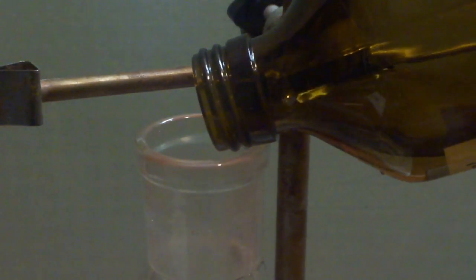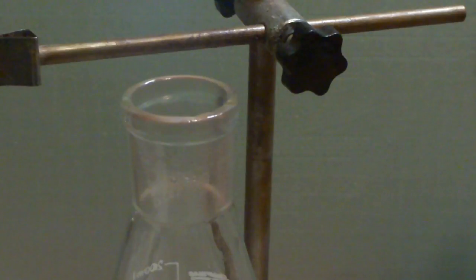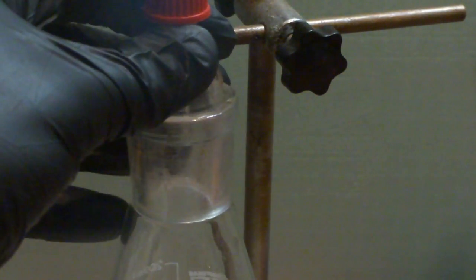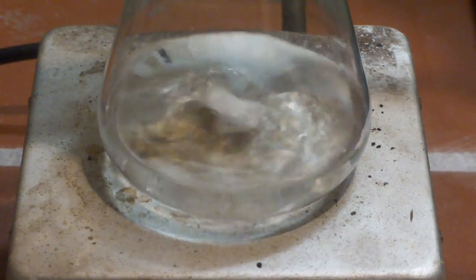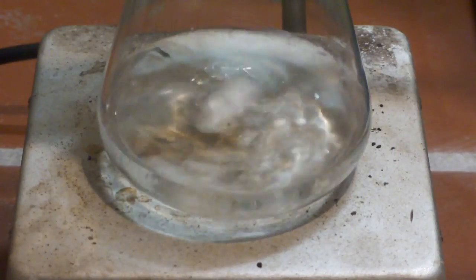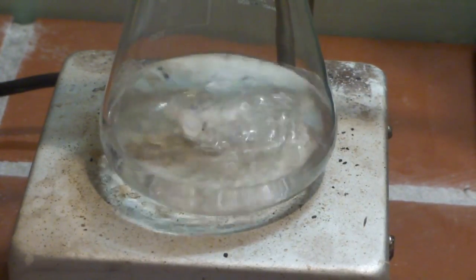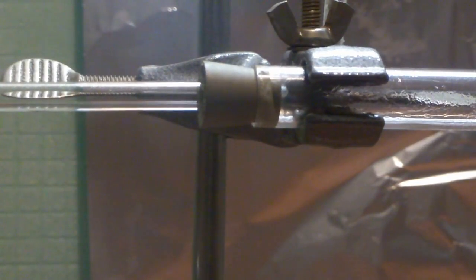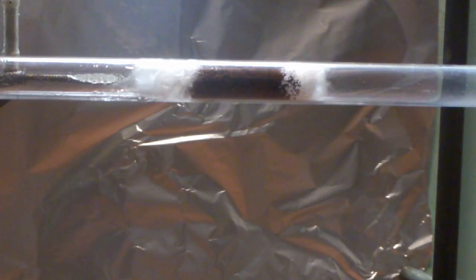Fill the flask with absolute ethanol and turn on the heating and stirring. As the air in the apparatus heats up and the ethanol vaporizes, some air gets pushed out of the apparatus. The gas flow soon increases. We have to wait until ethanol condenses in the combustion tube before we can heat the catalyst in order to avoid an explosion. Soon the ethanol starts to boil and we can see ethanol condensing in the quartz tube. We can now start to heat the copper catalyst.